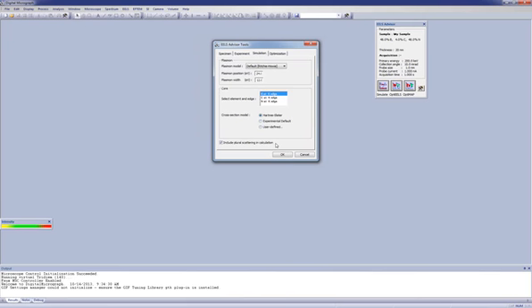And this again is useful if, for example, you've done some work or you know of some work that has modeled a particular edge or edges for a particular element, and we have a DM3 file variant of that model, then we can use that in the calculation instead.